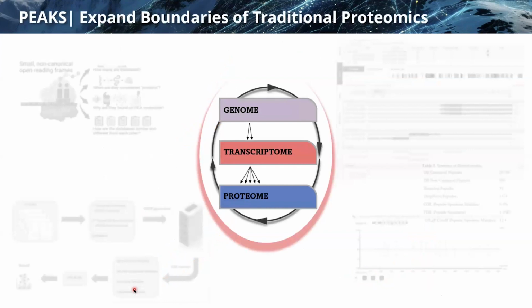So I hope that with this little rant on the sequencing, and this especially unbiased way of assessing the peptide sequencing, I could convince you that we have a very good, high accuracy deep learning based sequencing algorithm. So the next question is, how can we take advantage of this DeepNovo sequencing?